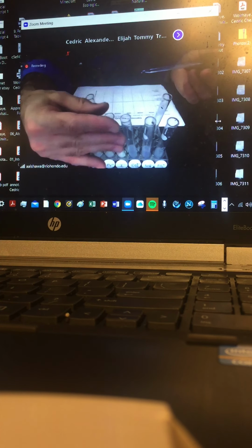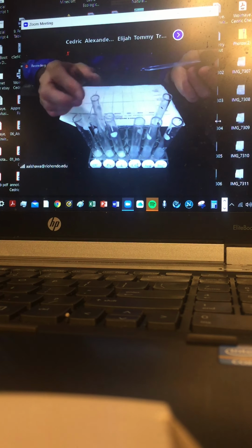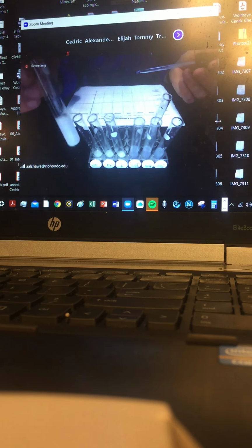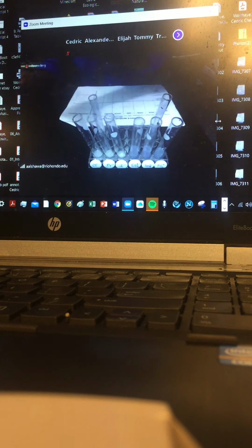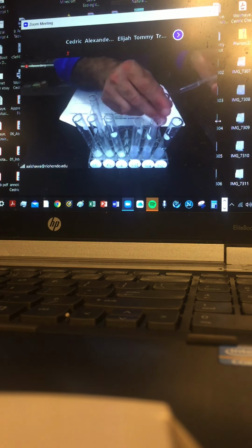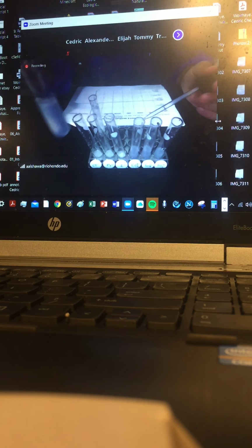So these are all halides. These are all polyatomic carbonate, sulfate, and phosphate. And unknown one, upon the addition of the nitric acid, produces the following. I want to add the same thing, a few drops of the nitric acid, but I'm using a sizable amount because I don't have 6 molar. So this is the addition. It becomes a little more clear.